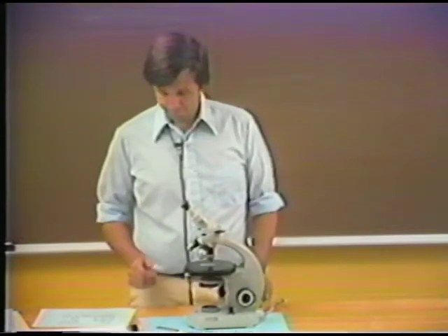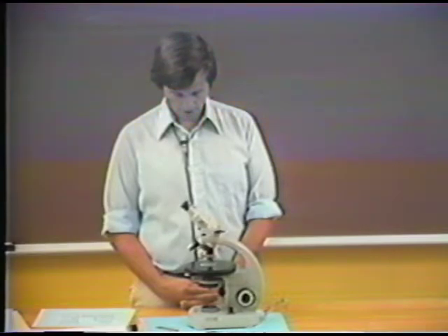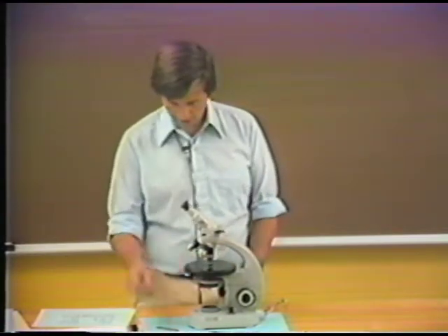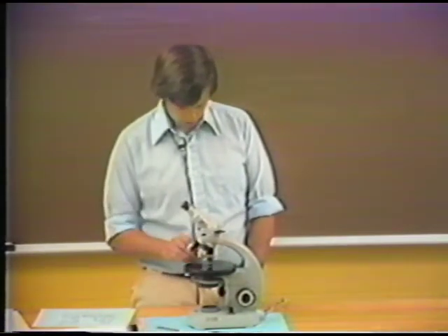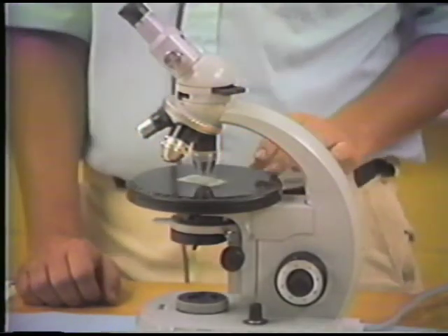Now, we can take any kind of uncentered figure and also determine the optic sign from it. For example, let's look again at the mount of the mineral quartz, and I'll obtain a typical sort of uncentered figure.